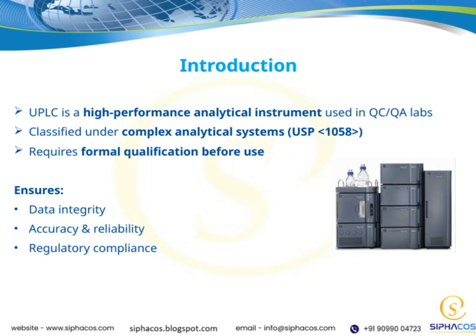By doing this, we can be confident that the data we generate is trustworthy. UPLC helps us ensure data integrity, meaning our results are accurate and tamper-proof. It also guarantees the accuracy and reliability of our analyses, which is crucial for making informed decisions. Most importantly, using UPLC correctly supports regulatory compliance.